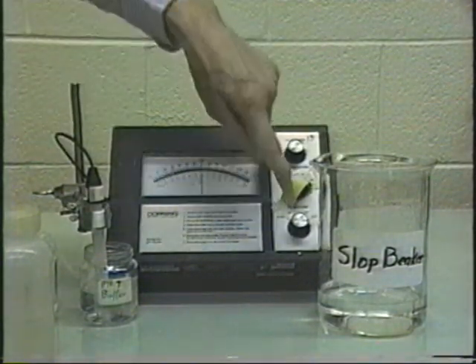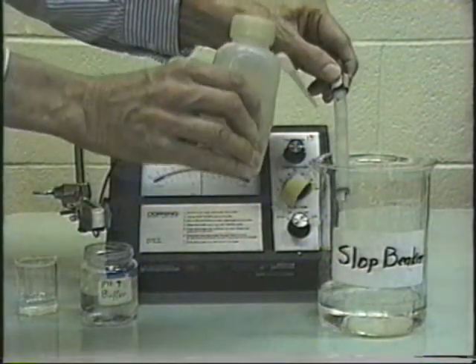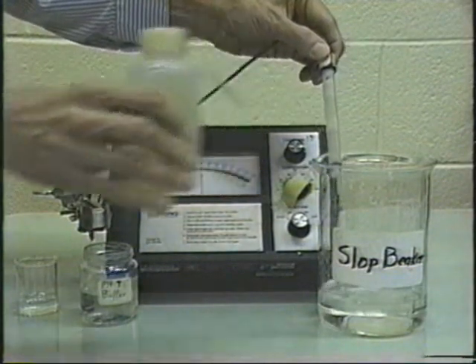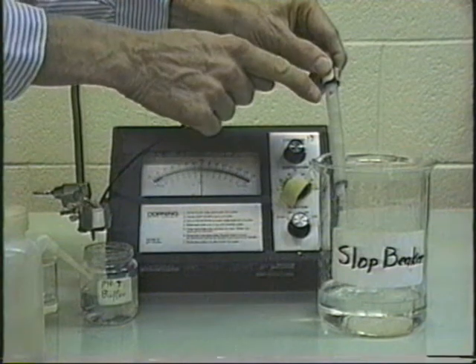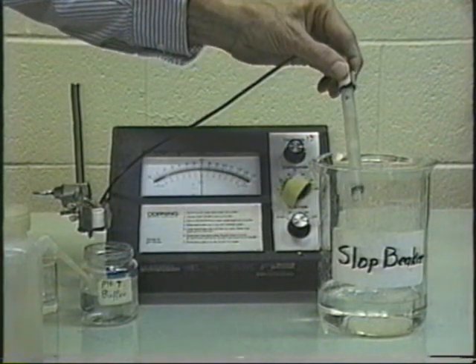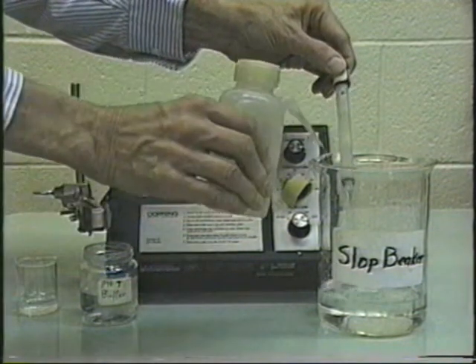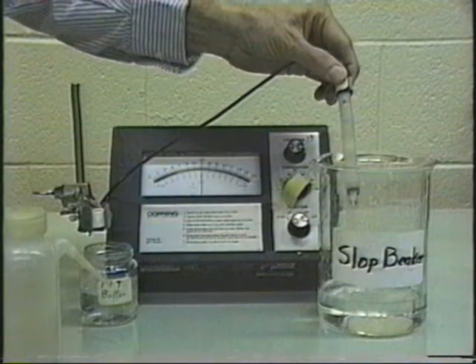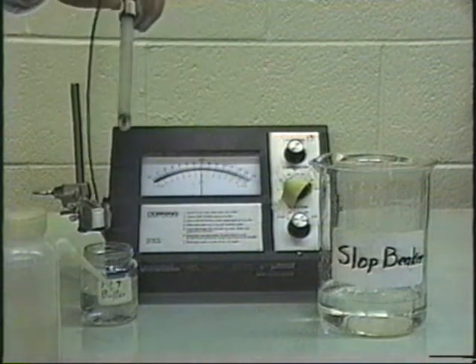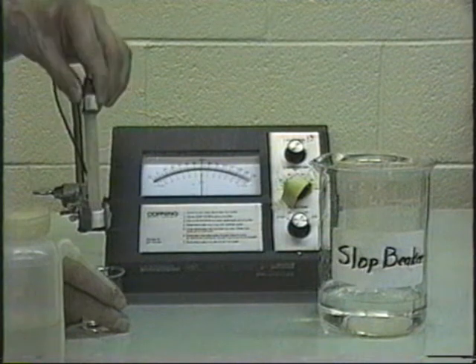To do that, we put this on standby and wash off our electrode. When you handle the electrode, be very careful that you don't tip it. As you can see, there's a hole here which allows filling of the reference electrode with saturated potassium chloride solution. So you must not tip it because the solution will run out. But anyhow, you wash off the electrode, pat them dry with a clean paper towel, and then you're ready to make your measurement of the solution that you brought here.